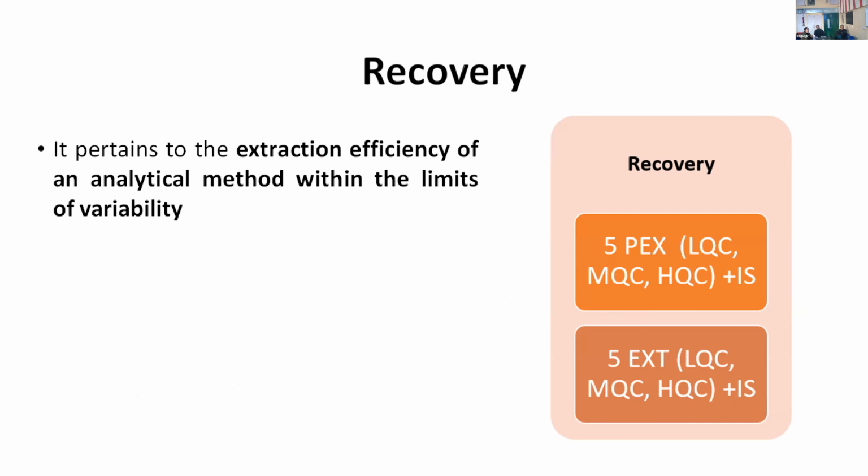So what will recovery tell us? It will tell us about the extraction efficiency of our analytical method. So what will we compare here? We will compare the procedure followed for extraction. For example, you have diluted your sample with acetonitrile. Here we will compare the results with the post-extracted plasma, where the extraction procedure has been undertaken previously, spiking the drug after the extraction. So it will tell us how efficient our extraction procedure is.